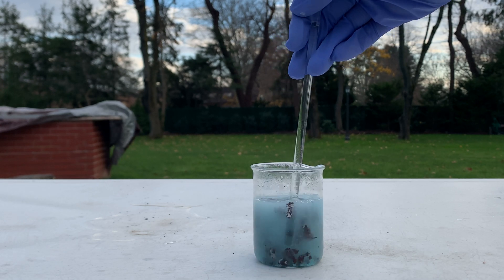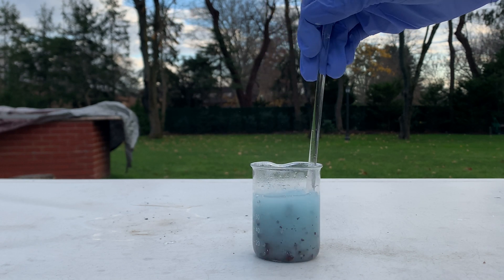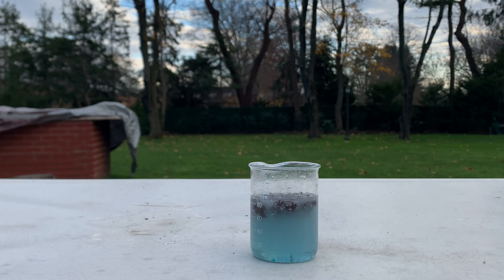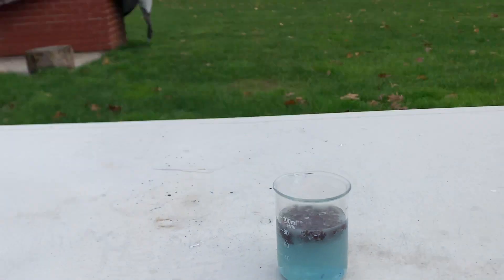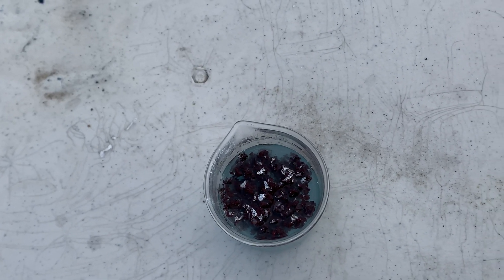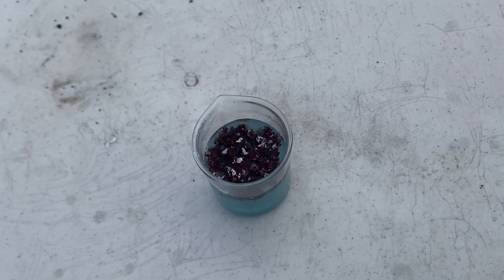This turned out really great. I'm going to let this reaction settle down a bit, then check back in with you guys to do the filtration process and isolate our copper metal. Let me give you guys a quick look at the top — a lot of copper metal floating right to the top. We'll get right into the filtration after this.